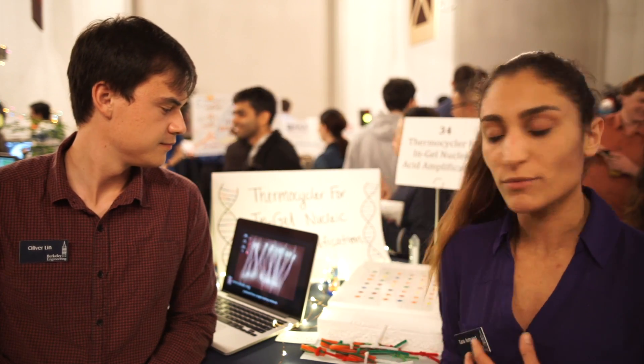The proteins in each cell are very important to developing a better diagnosis and creating better drugs for these patients. What the lab has actually done is created a way to detect proteins in single cells. But unfortunately, when you do the electrophoresis and you get your protein bands out, you can get proteins that are at very low concentrations and you can't actually detect these proteins accurately.